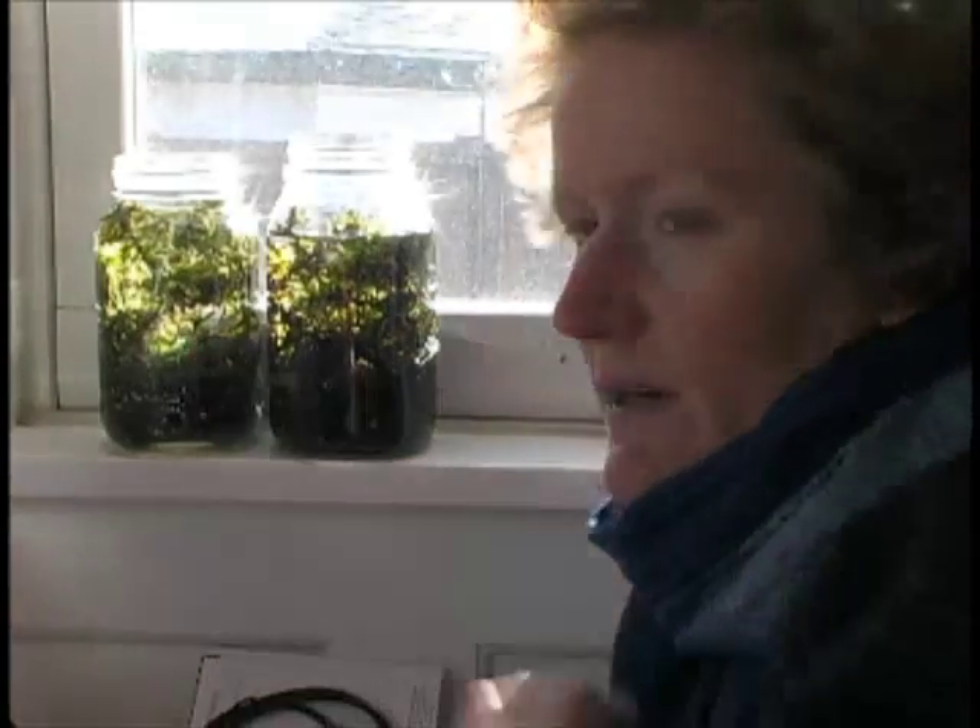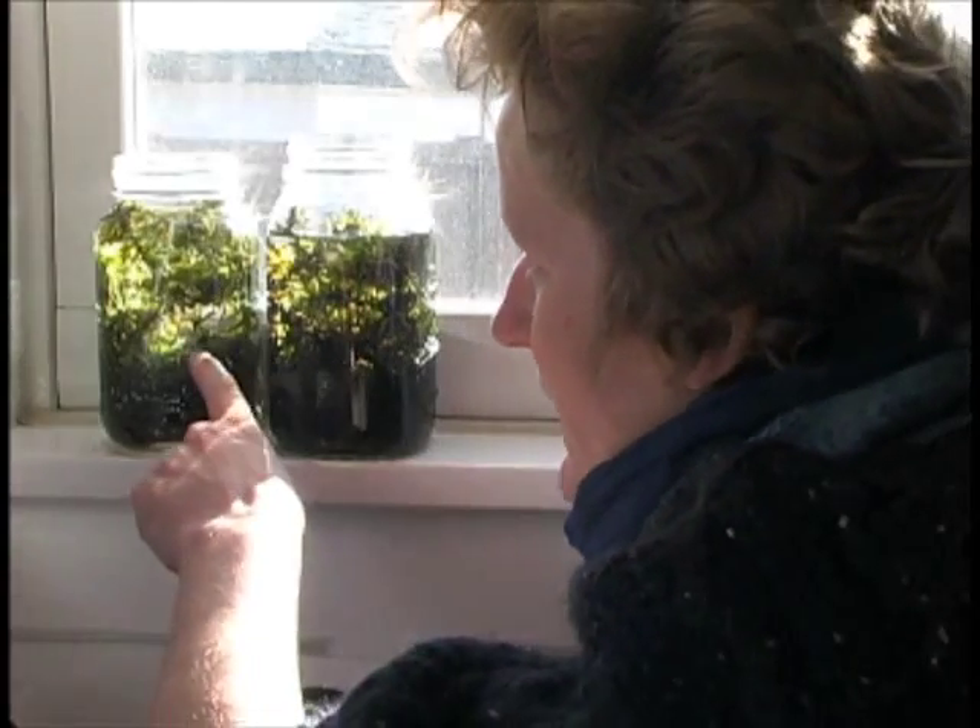Elodea gives us a unique opportunity to observe photosynthesis in action. By using an aquatic plant, we can see the small bubbles of oxygen formed, and we can see them rise through the water. If we have a regular plant, we can't see the oxygen because it just becomes part of the air.